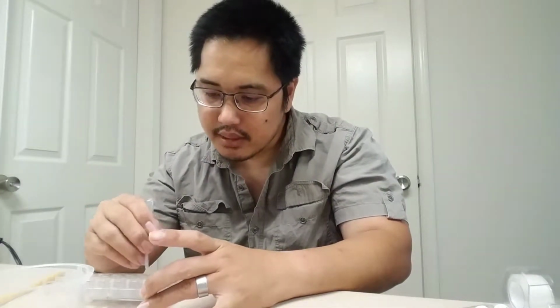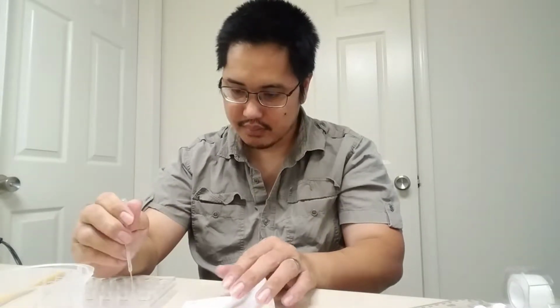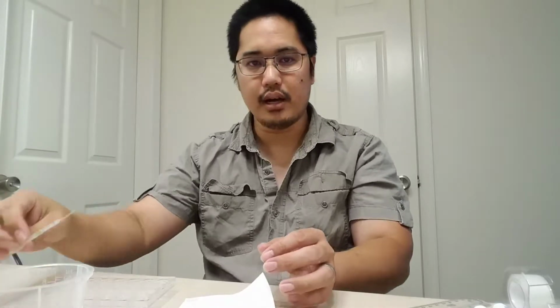And we want to mix this with a small mini pipette. Use the mini pipette to put a drop of mixture on the first mark. So I'm going to mix it up a little bit like that. And then I'm going to take this, suck it up, and just put 1 drop there. 1 drop. Got it. Now I'm going to let that dry a little bit. And while this thing is drying, I'm going to put some other marks on there.